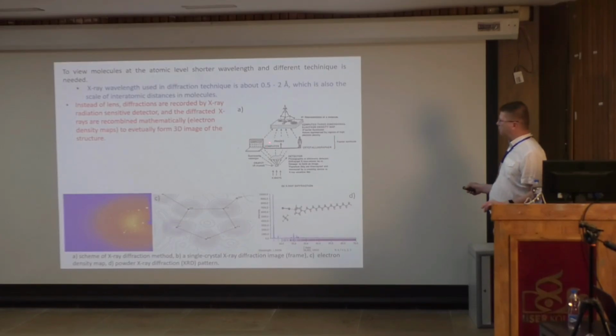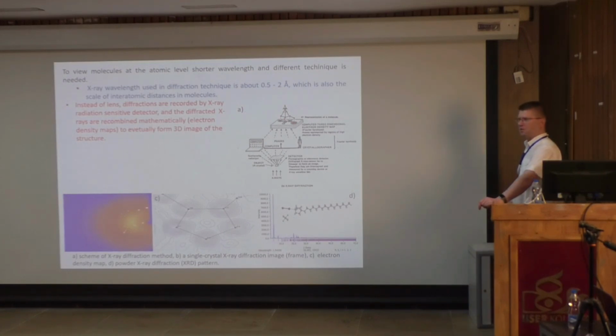It actually tries to locate the phases from this data. And then there are you. You are the person that does the work with the computer. And if everything goes well with you and the computer, you can create the phases. And when you get the phases, the computer programs can create an electron density map. And this is actually the product.